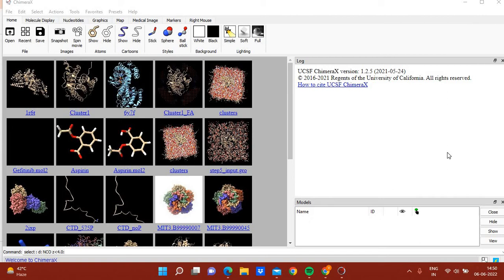In this video I'm going to talk about the AlphaFold structure database. AlphaFold is an AI-based program which is used to predict the 3D structure of a protein from its primary sequence. AlphaFold has performed well in CASP14 and researchers believe that it will revolutionize drug discovery.